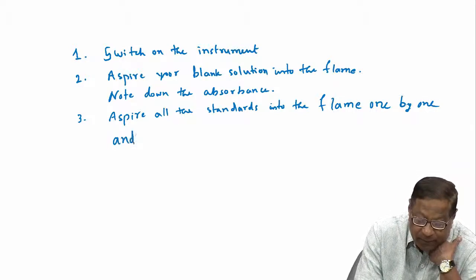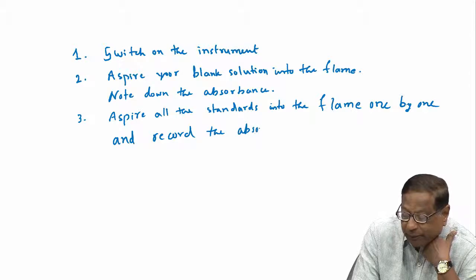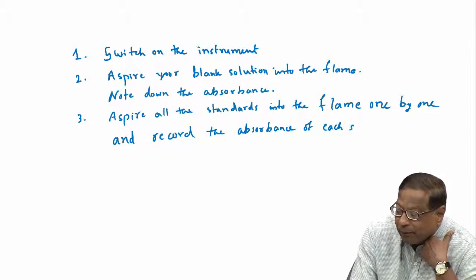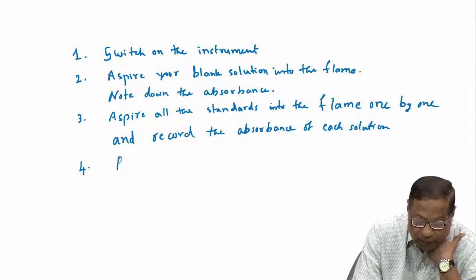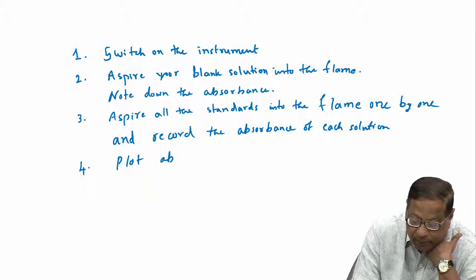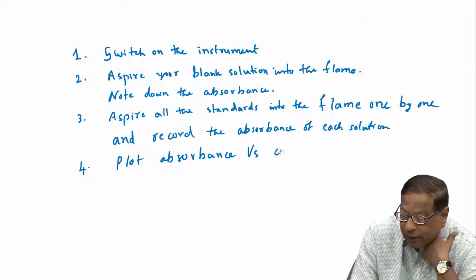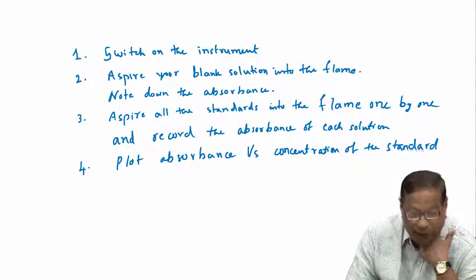and record the absorbance of each solution. Afterwards, plot absorbance versus concentration of the standard. This is the next step.